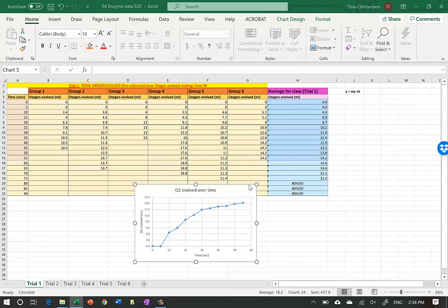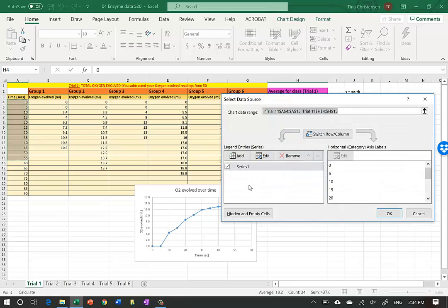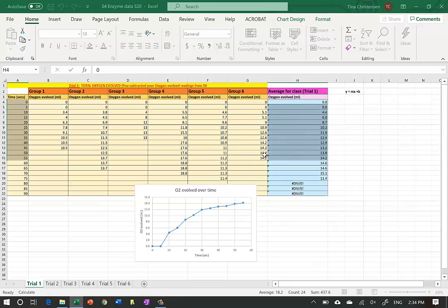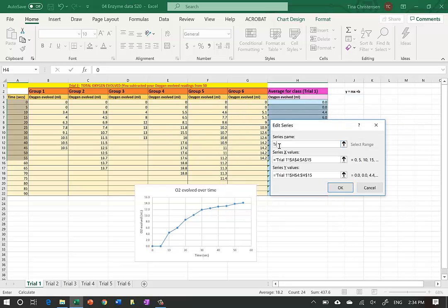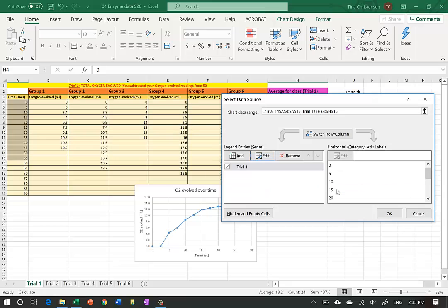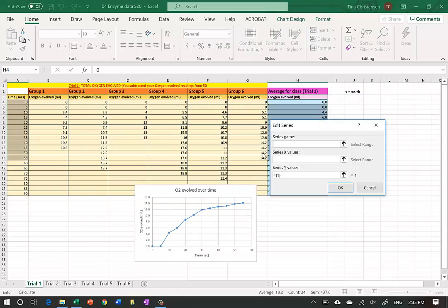The Select Data dialog shows that one series is already graphed. I want to change the name on that, so I'll hit Edit and call it 'Trial 1,' then hit OK. To add more data we hit Add. The next one will be Trial 2, and I have to select the X values - these will be the same on all trials, going from zero to 55 seconds.